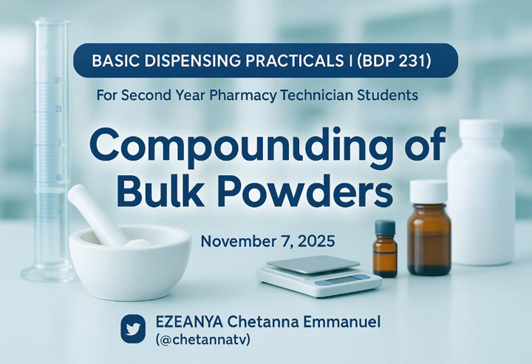For bulk powders, we have bulk powders for internal use, the ones you take, either mixing them with water or however you take them. Then we have bulk powders for external use, the ones you apply on the skin or on some cavities. For the purpose of today's practical, we are going to look at bulk powder specifically, by God's grace, both bulk powder for internal use and bulk powder for external use. Are we together? Good.